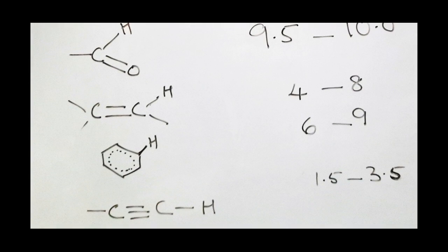A carbon-carbon double bond, an ethylenic group. A benzene ring has 3 conjugated carbon-carbon double bonds, so there is a circulation of pi electrons.